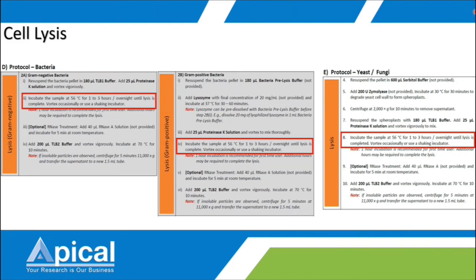If you have done the RNase treatment but still found that there is RNA in your sample, do double check the condition of your RNase. There are a few cases that we find like this. So do store your RNase at minus 20 degrees Celsius, and the shelf life for RNase is up to 6 months only. So make sure you keep it well.